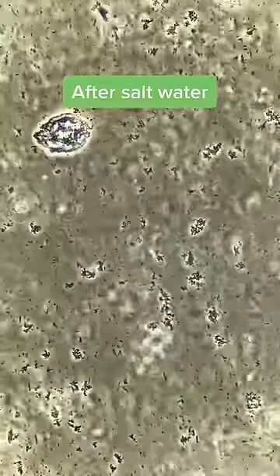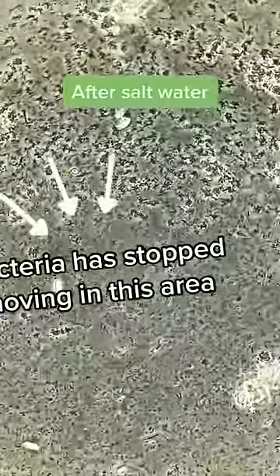A wave of salt solution passes through. The bacteria are swept up and killed almost instantly. This clip shows a wave of salt solution slowly passing through and killing the bacteria.